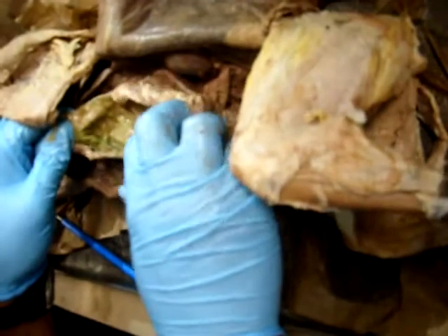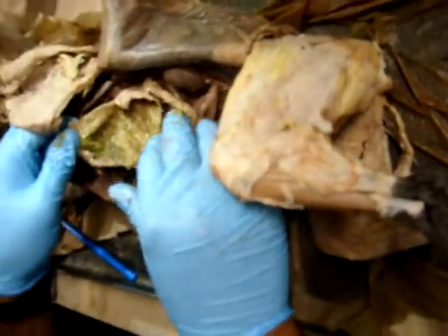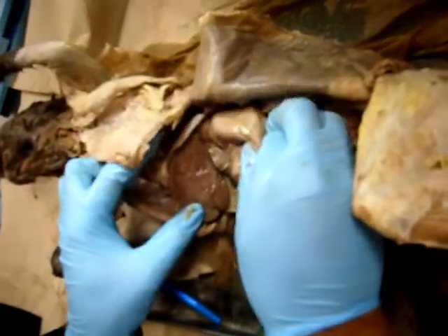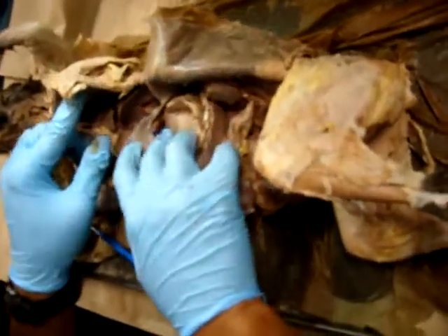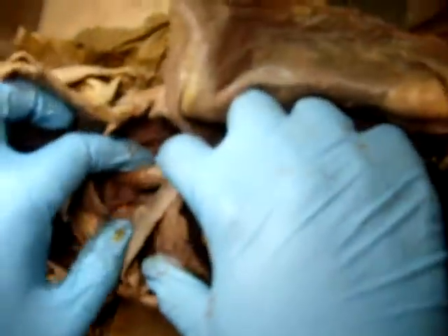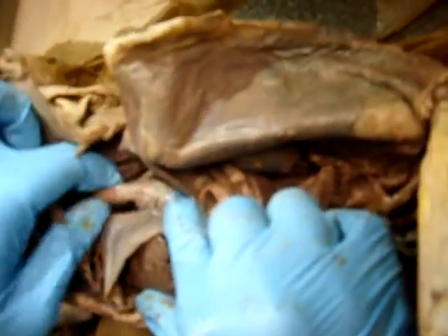Folds would be the rugae, but it's pretty distended, so you don't see it as much. See the fold? Oh, the rugae. That's the stomach. Where's the cardiac sphincter? Does the cat have two? Yeah, of course, but all those are small structures you won't be able to see. See, here's the esophagus. See this tube right here? It'd be at the bottom right there.